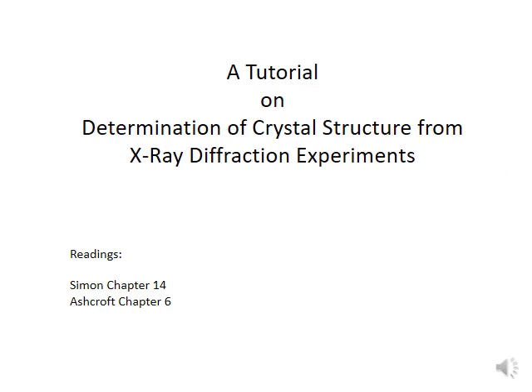So in the last two modules, we had a look at the phenomenon of scattering from a crystal. We got to know a very important principle from there, that scattering only occurs if the difference of the scattered wave vector and the incident wave vector is equal to the reciprocal lattice vector of the crystal on which a certain probe is incident.